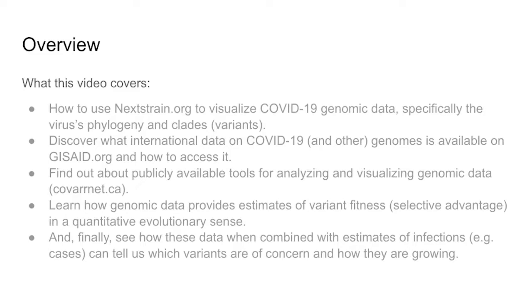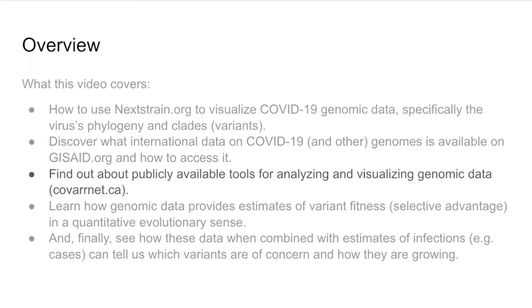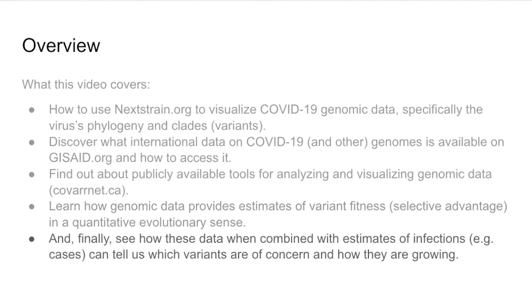In this video we're going to cover the following topics. We're going to talk about nextstrain.org and how to use that to visualize COVID-19 genomic data, specifically visualizing the virus's phylogeny and its clades. We're going to discover what international data on COVID-19 is available on GISAID and how to access it. We're going to look at publicly available tools for analyzing and visualizing genomic data on covarrnet.ca, and learn how genomic data can provide estimates of variant fitness through the quantitative notion of selective advantage. Finally, we're going to see how these data, when combined with estimates of infections — cases or something equivalent — can tell us which variants are of concern and how those might be growing.